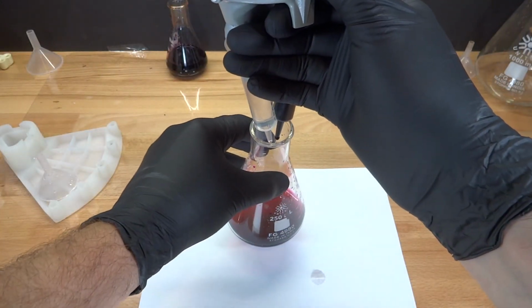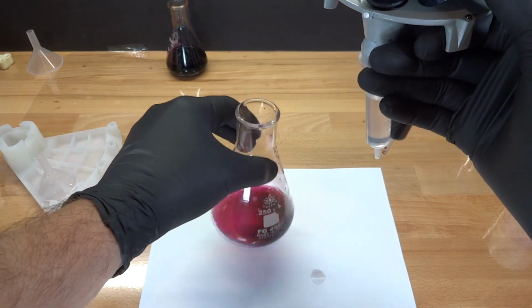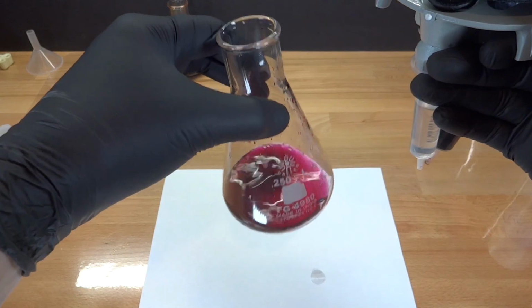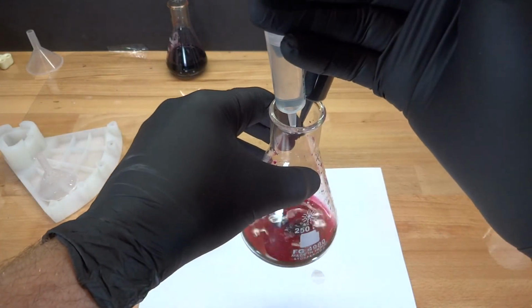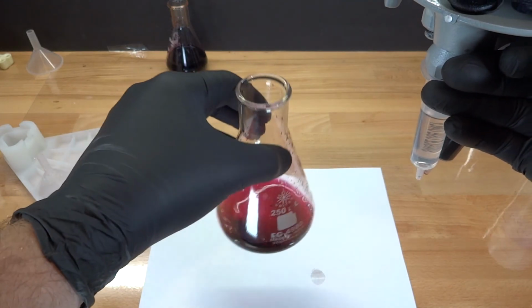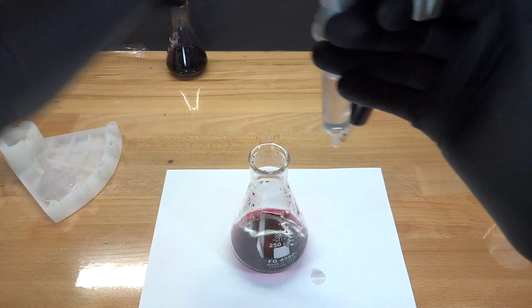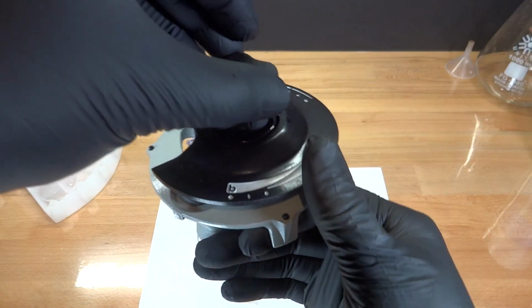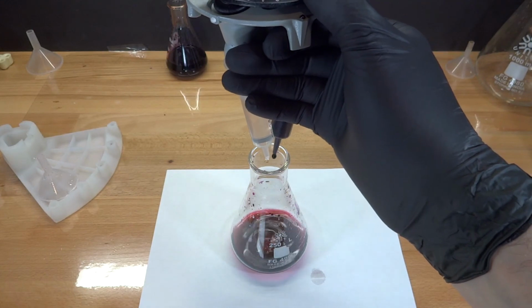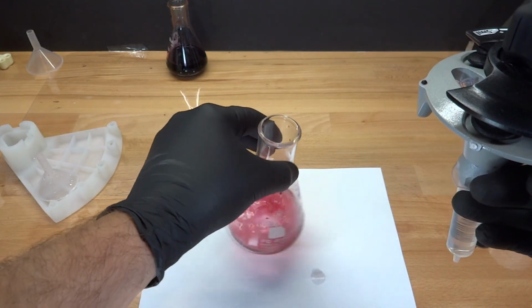A new ratio, more biased towards hydrogen peroxide, is selected. Having dispensed the new reagent volumes and agitating the solution, we do not observe any significant change in color. A yet more hydrogen peroxide heavy ratio is selected. Now the reaction is progressing towards a redox point.